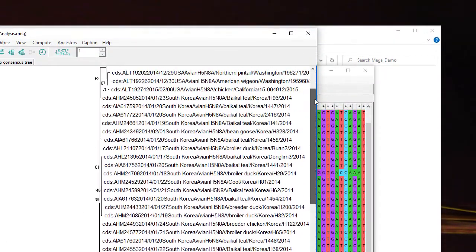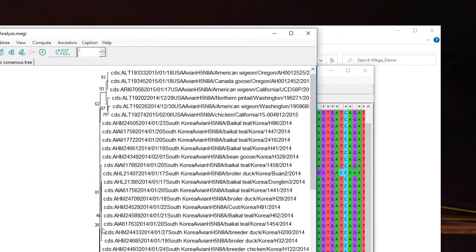When you've got viral sequences like this, you end up quite often with low bootstraps because you've got very few changes. If you're looking at very large scale evolution, so you're looking at something like sequences from chimpanzees, apes, and so on, then this will give you a much clearer tree and the bootstrap values will be much higher.